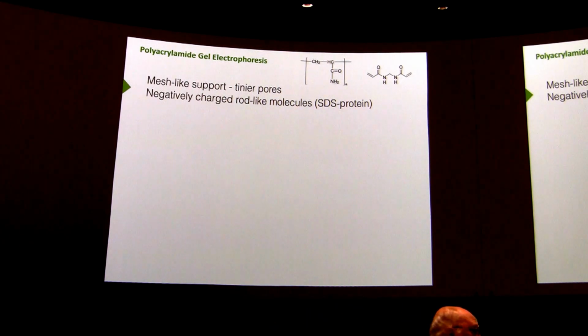And like we had with DNA, you might say, well, why do we use polyacrylamide versus agarose gel electrophoresis? Well, since the polyacrylamide has smaller pores, smaller holes through which things can move, it's better for isolating smaller molecules. So most DNAs will separate on agarose gel electrophoresis, but if we're looking at very small DNA molecules, polyacrylamide gel may work actually a little bit better in terms of being able to separate things. So it depends on what size of things we're trying to work with.